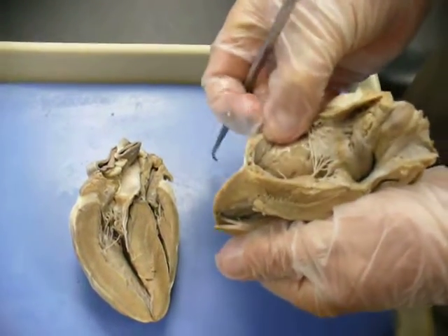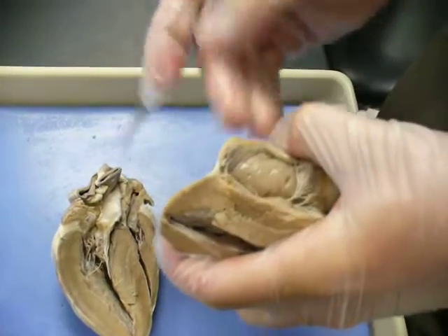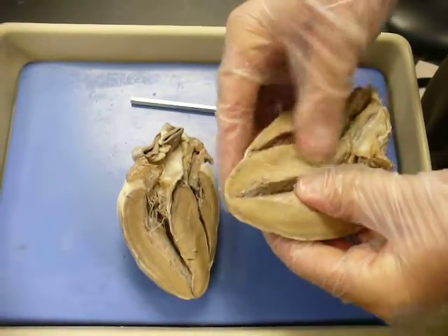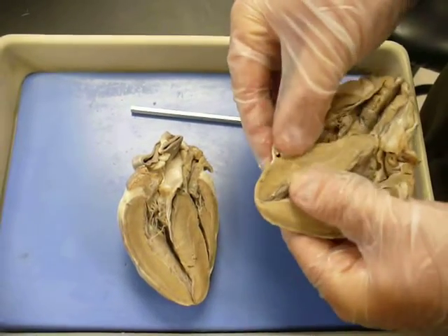Those chordae actually go into the papillary muscles, which are right here. This is actually the right ventricle, and you can see this muscle is actually called trabeculae carnea in the ventricle. Very thick septum — that's your ventricular septum right there. That's where your bundle of His and your bundle branches come down through.